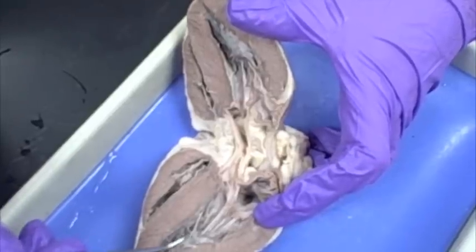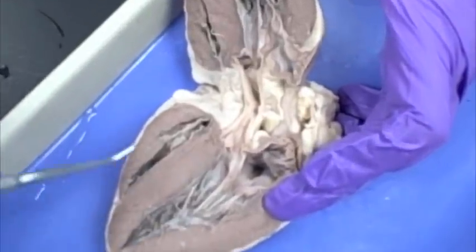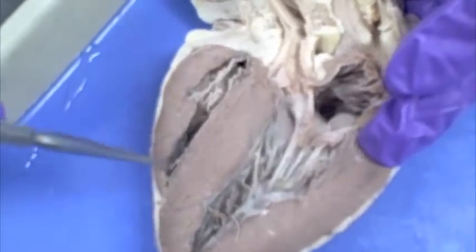This chamber here is at the bottom and it's on the left side, so this is the left ventricle. This chamber here is on the right side and it's at the bottom, so it is the right ventricle.